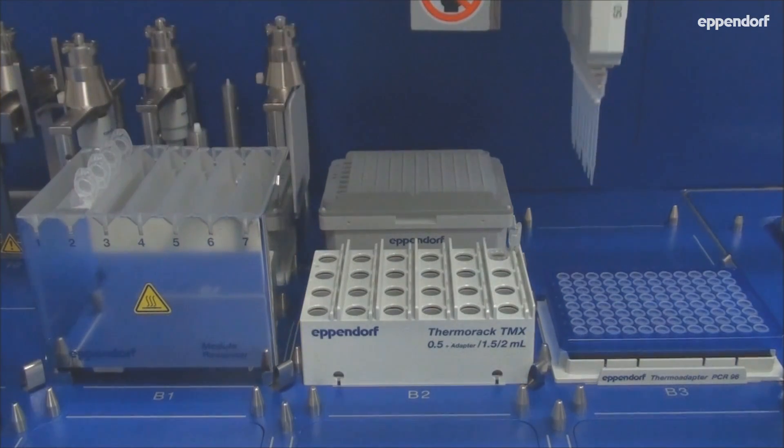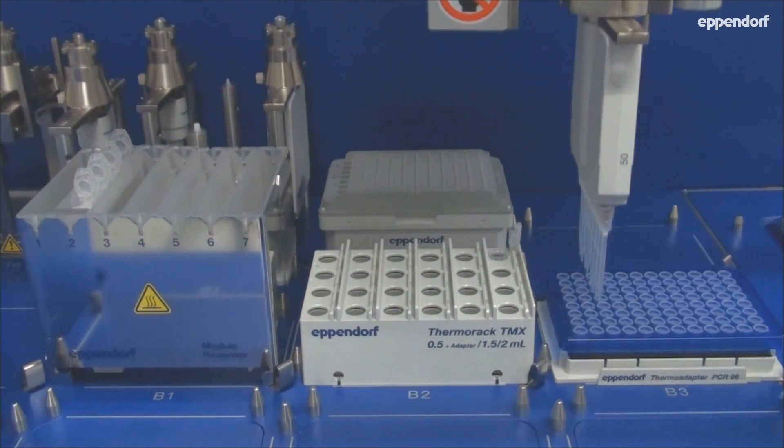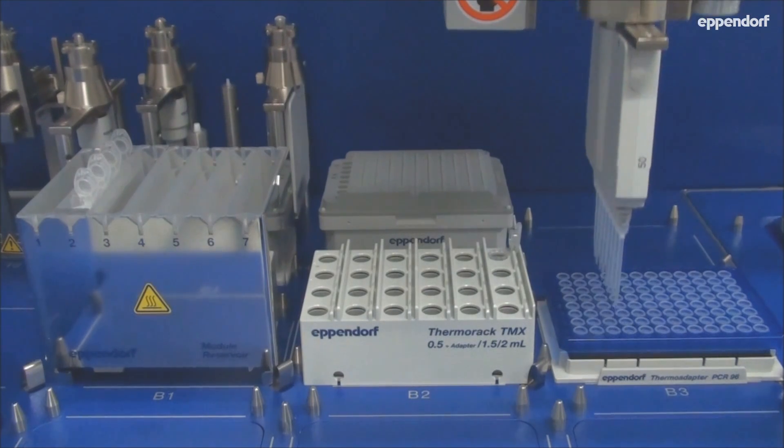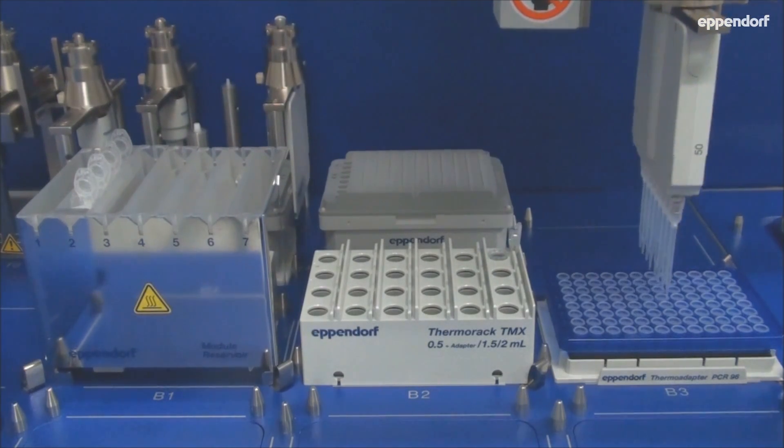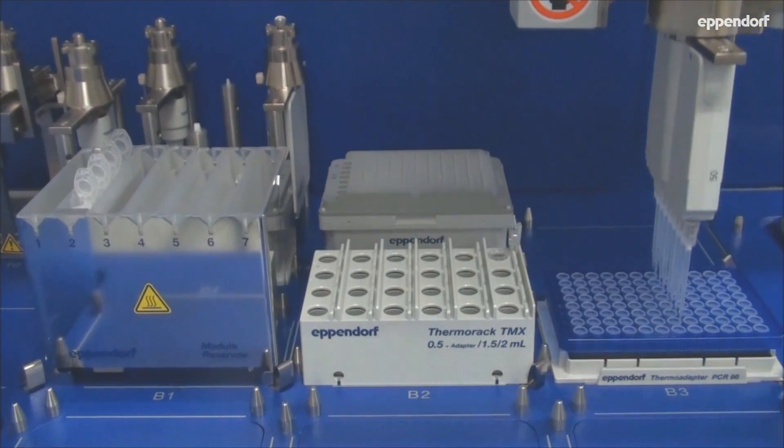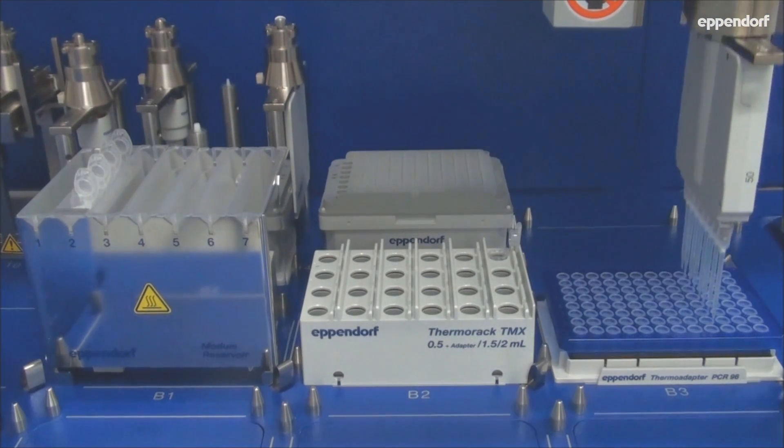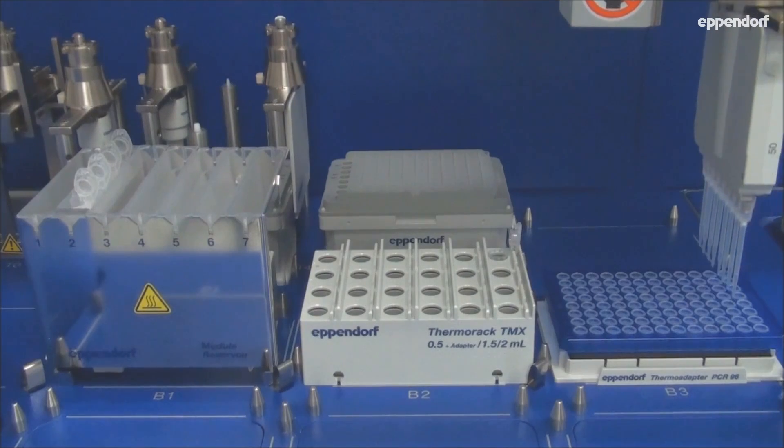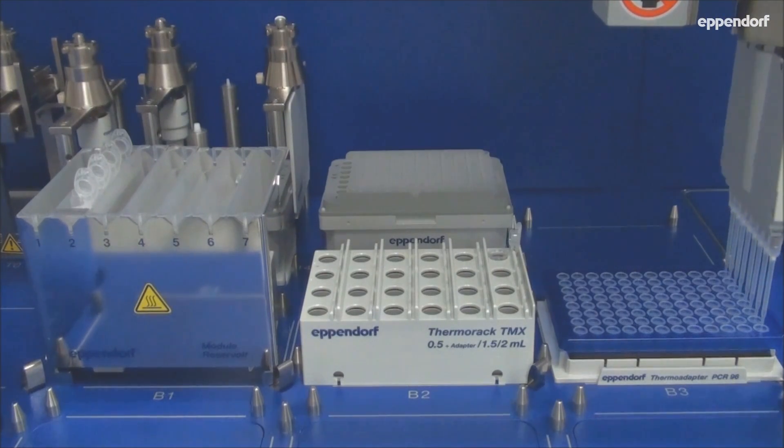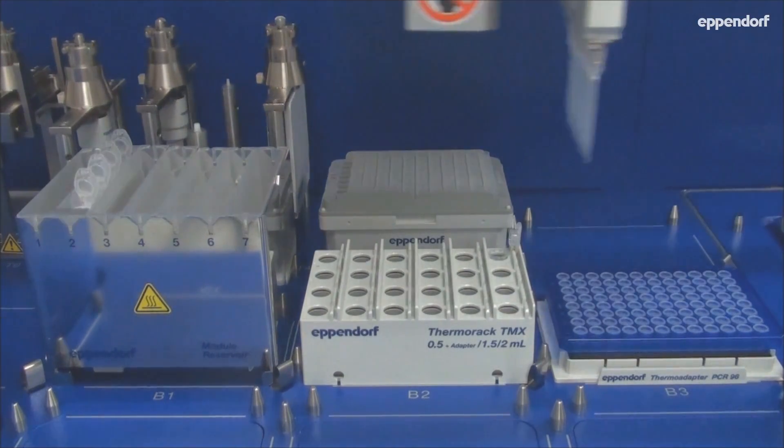Next, the samples are treated with polymerase to adenylate the DNA strands. All incubations are performed within the enclosed workstation, preventing contamination and unnecessary user involvement. Each different reagent has an optimized liquid class setting to maintain a high degree of accuracy.